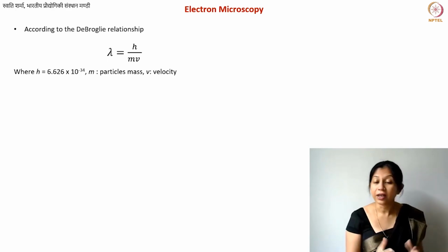So you can use different electromagnetic rays for imaging purposes. But can we also use electrons? Because electrons, we don't know what they are, whether they are waves or particles. However, there is one thing that definitely works for electrons, the de Broglie relationship, which you definitely know.